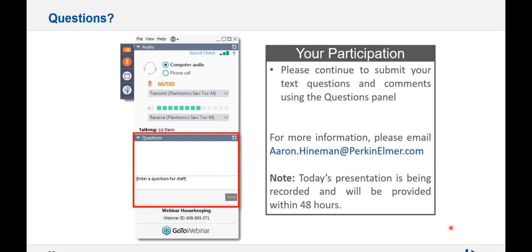And for the most part, our modifiers are very clean. I mean, we were very careful in getting the source of modifiers. So I suspect it's made up too strong, and that will give you more background. If it's too strong of a solution, it will give you more background, not less. So that's the first thing I would do, is make sure it's made up correctly.